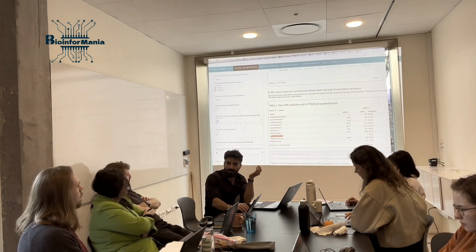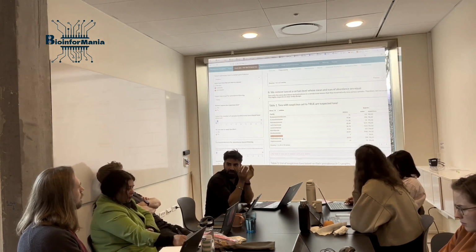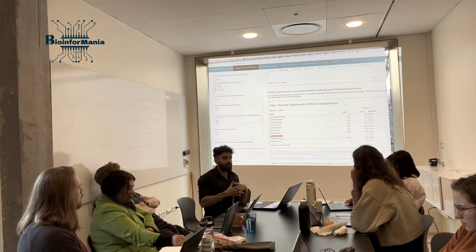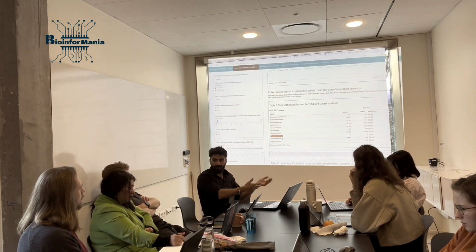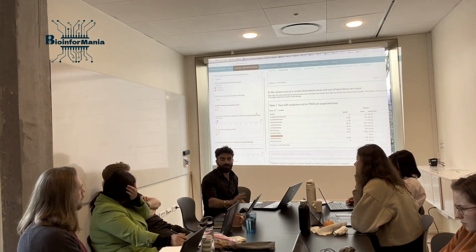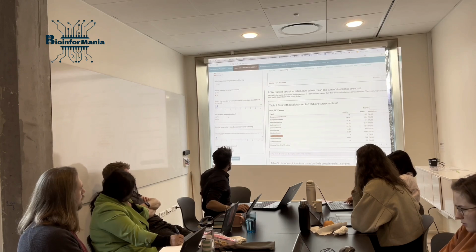This is how you need to look at this. Sometimes it really doesn't exist. Sometimes it comes from, I don't know, some lake or something, or it's a strict aerobic bacteria. Maybe it should not belong to a healthy gut of the mice. We don't know. You need to check this and know what you're doing here, okay? Anyways, I'm going to set to no here. I don't want to remove that.